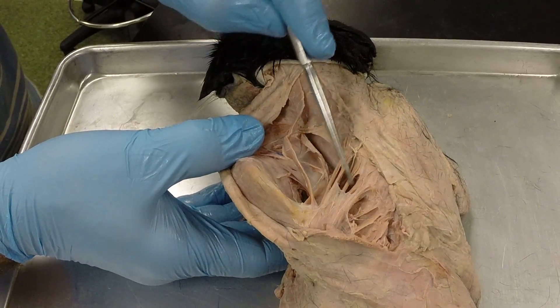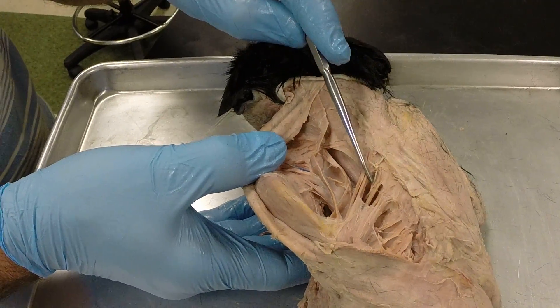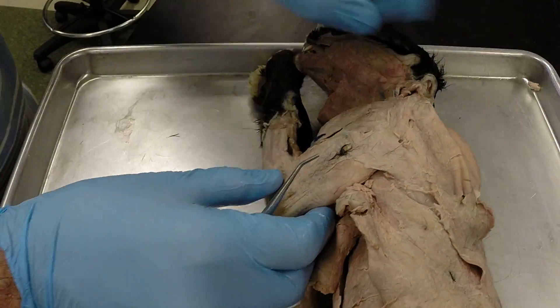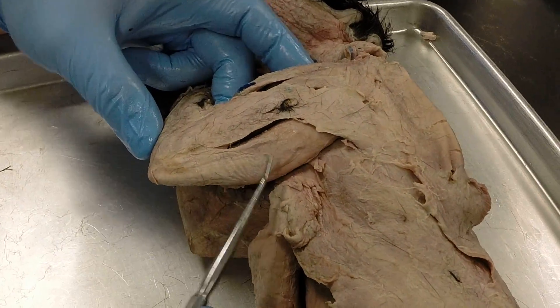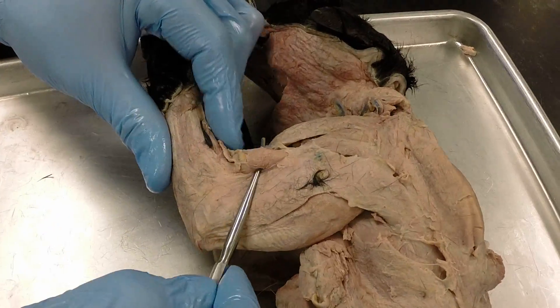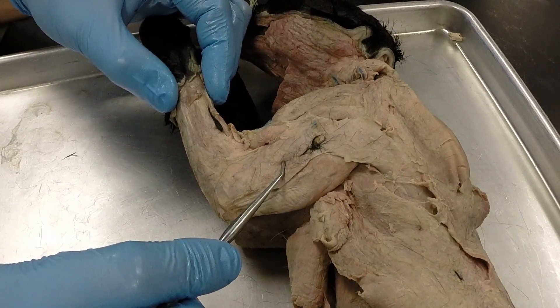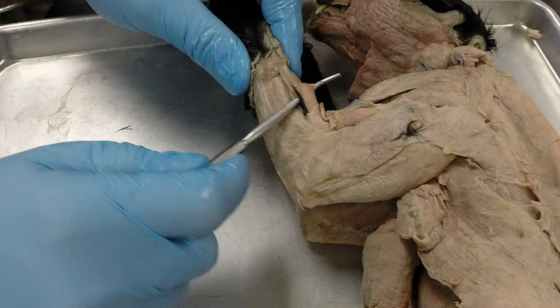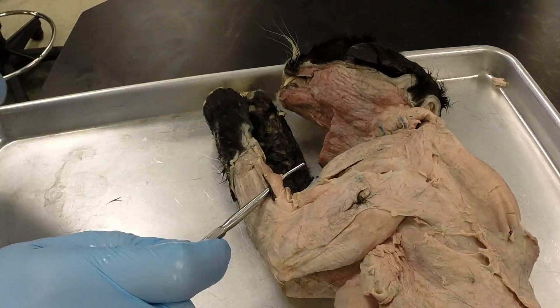Then we have several little filaments going from the spine to the back of the shoulder blade — these are the rhomboideus muscles. Moving out to the arm, we have the long head of the triceps brachii and the lateral head of the triceps brachii. Then we have the brachialis muscle, which is in between the clavodeltoid and the lateral head of the triceps brachii. Then we have the brachioradialis, which is the only muscle on the lower forearm that you need to know.